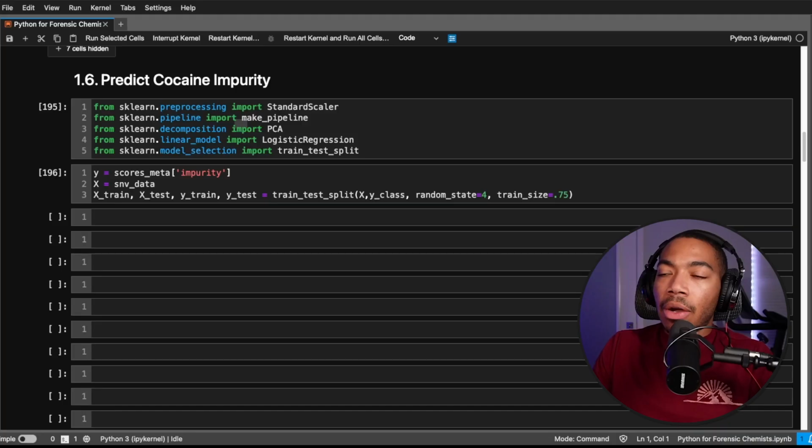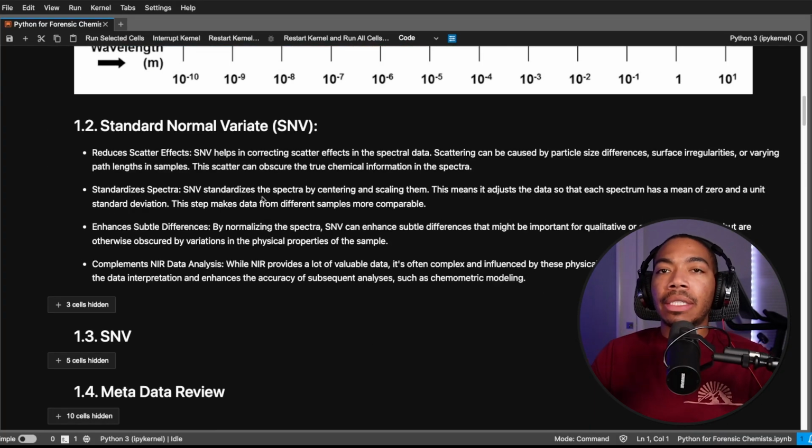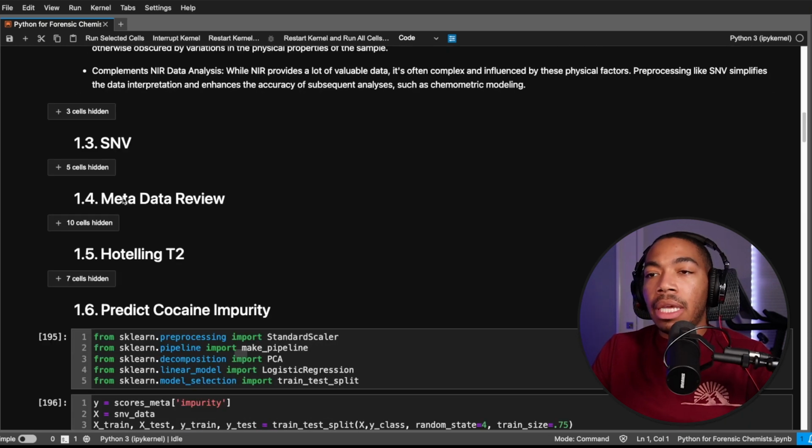In today's video, we're going to continue in our Python for Forensic Chemists data series. Now, over the course of this series, the emphasis has really been on how we can extract more information out of our data at every point in time. If you look at the past videos, we used the standard normal variate to get more information out of our near-infrared spectroscopy data. We then took a deeper dive into the metadata to get more information out of that and used that to understand our overall data set better.